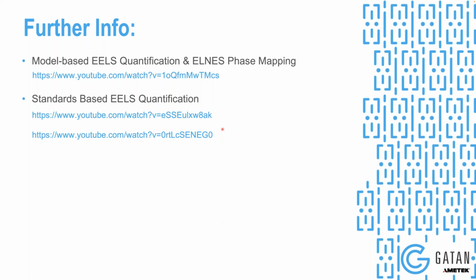So if you couple that with the maximum energy offset that we can do for the DualEELS, 2000 eV energy offset, the maximum range that you could go from 0 up to max would be something like 5000 eV. So you can go over quite a big energy range. And you don't have to do low loss if you didn't want. You could do 2 high loss acquisitions. The constraint is just that the low and the high need to be separated by no more than 2000 eV. The low doesn't have to be 0.